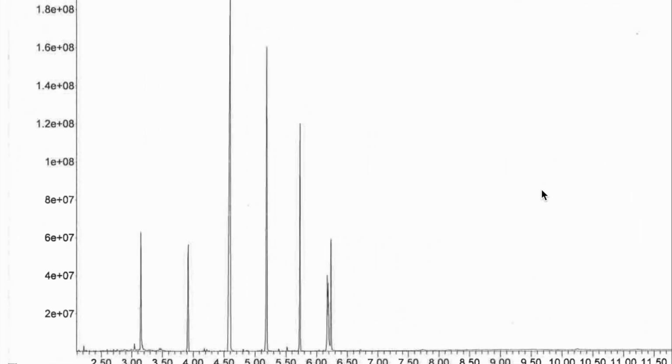All right, so I just wanted to remind everyone what this GC trace means, because it's been a while since we used the GC.